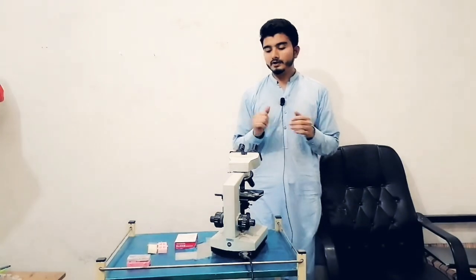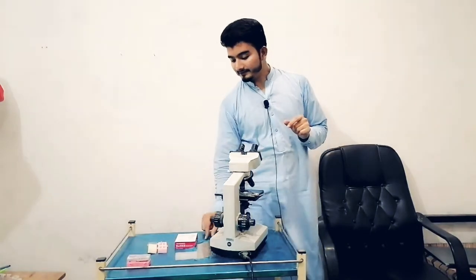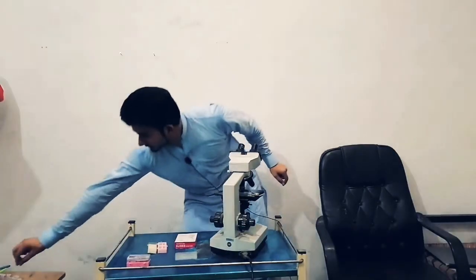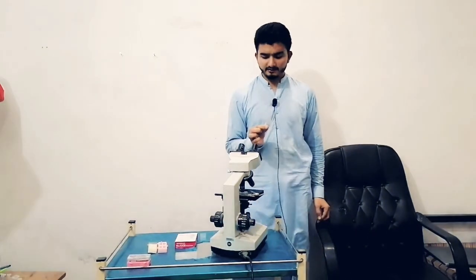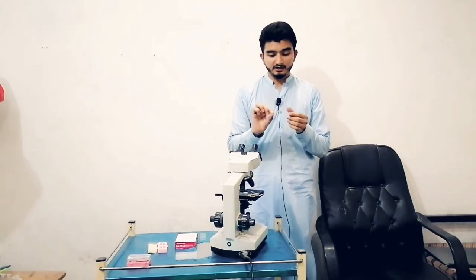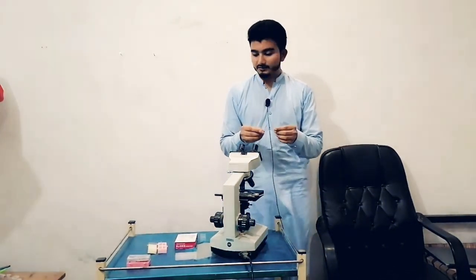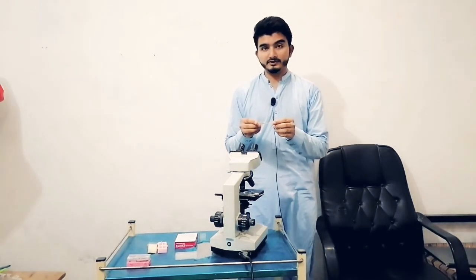Now if we have to study a blood smear, we should take a drop of blood on the slide. I made this smear 10 minutes ago. You should make a finger-like smear, then you will dry it, then you will put methanol on it in order to fix it, and then you will put the Giemsa stain, or Leishman stain, on it. After staining, you will properly examine and observe it on the oil immersion 100x lens.